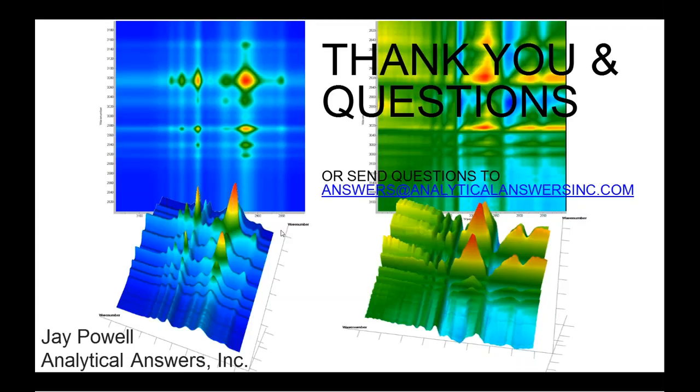To do transmission sampling of the system you described, it would involve taking a thin slice across that bond and doing infrared transmission, either of the Kevlar epoxy bond or just of the epoxy sample. But we could do, like I said, either reflectance or ATR and compare it to a known, properly mixed and well-cured sample of that same epoxy. Again, the actual details depend a lot upon the materials, the Kevlar and epoxy, the size of the bond, and so on. But that's certainly possible, yes.